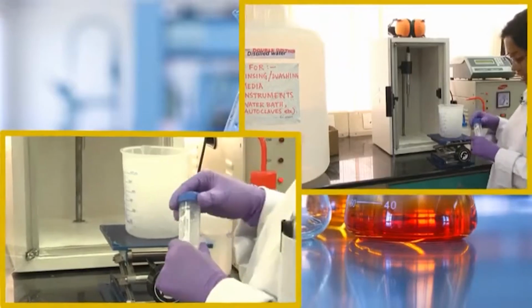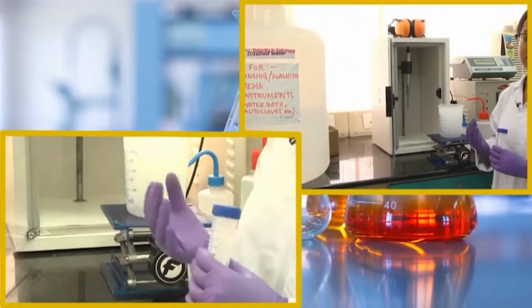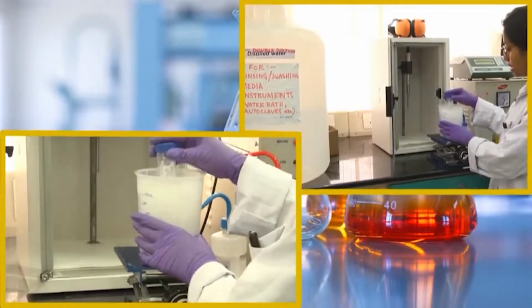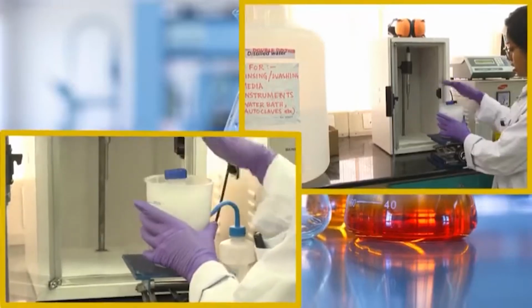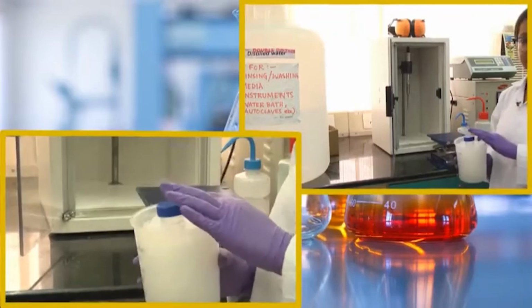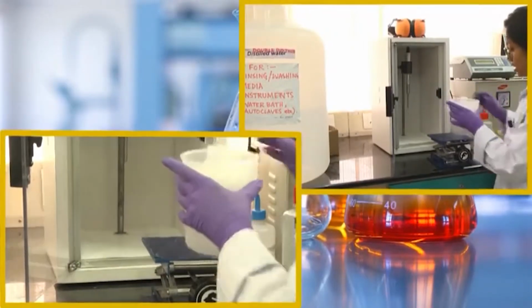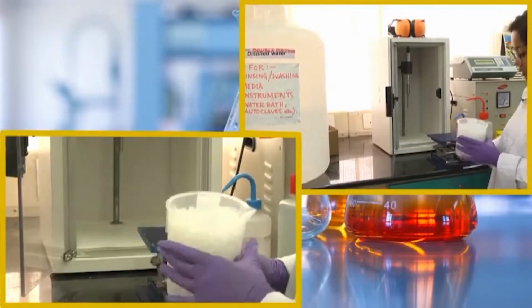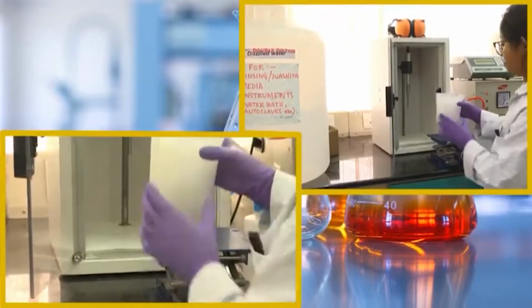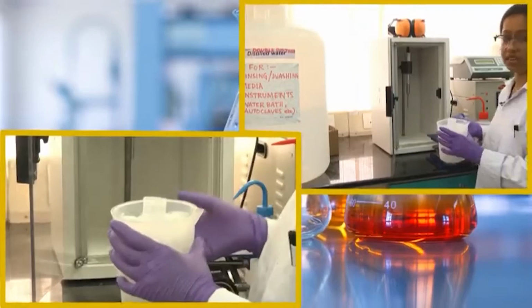So, a large amount of heat will be generated, and you do not want your sample to be degraded because proteins are heat labile. So, for that purpose, we will keep our sample solution inside this ice box, and the probe will go inside this solution. We will open this cap and it will go inside the solution. Whenever heat is generated, it will be lost because we are keeping it in the ice. So, there will not be too much heat inside the solution which might degrade our protein.